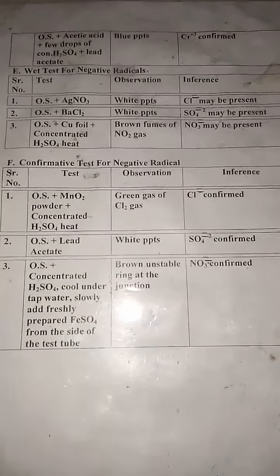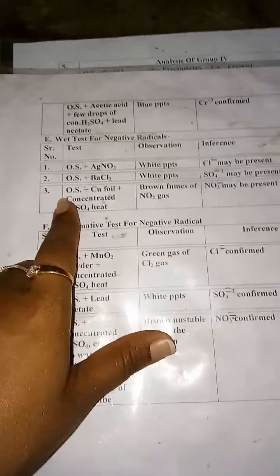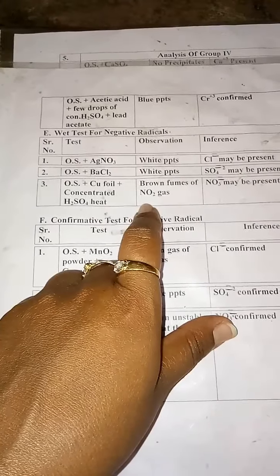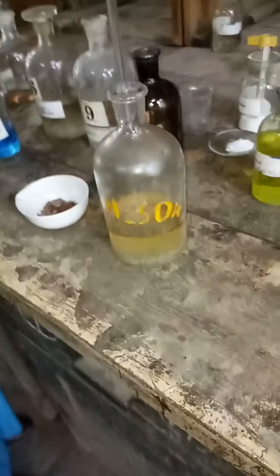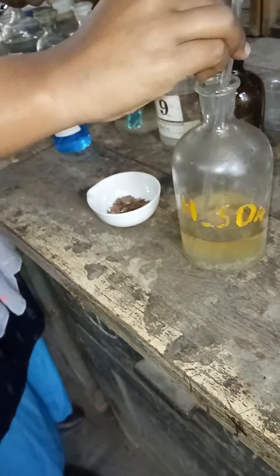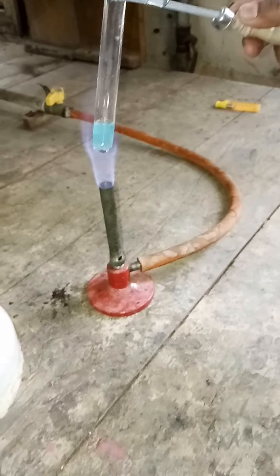Now we move towards the negative radical. We start with the wet test for the negative radical. The first test is OS plus AgNO₃ — if you get white precipitates, Cl⁻ may be present. I take a small amount of OS in a test tube and add AgNO₃. As you can see, you don't get any precipitates; you have a clear solution, so Cl⁻ is absent. Next is the sulfate ion test: OS plus BaCl₂ — if you get white precipitates, SO₄²⁻ may be present. I add BaCl₂ and observe a clear solution, so SO₄²⁻ (sulfate ion) is also absent.